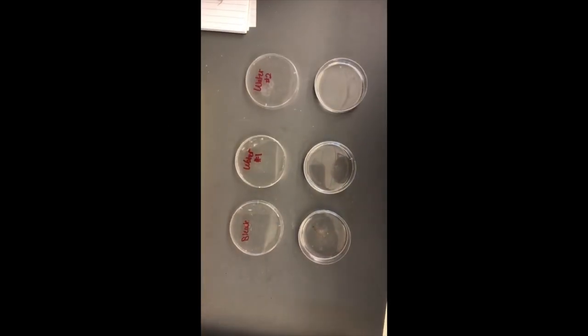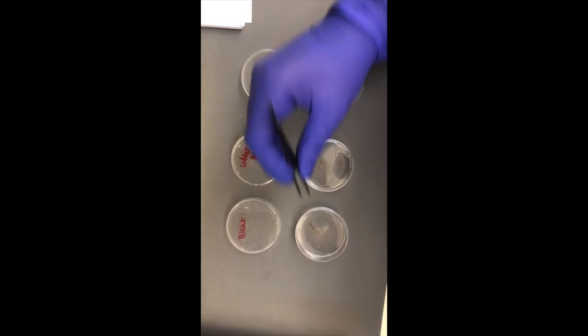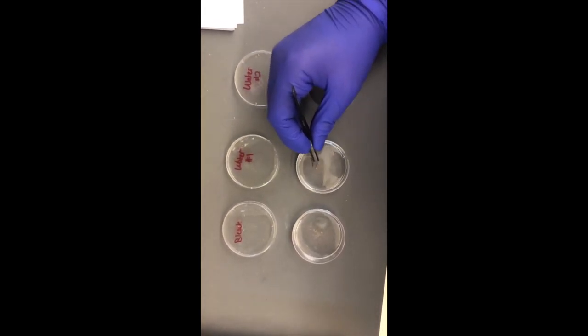Before extracting the DNA, I rinsed the spines in a diluted bleach solution, followed by two water rinses, in order to get rid of any potential contaminants that were still on the spine.